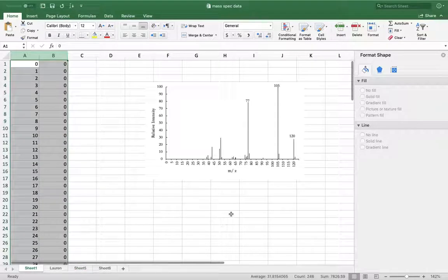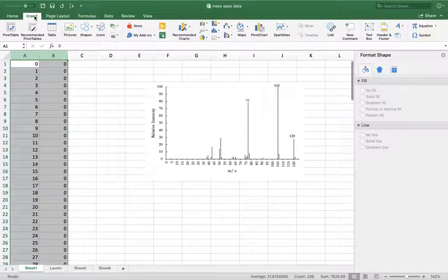So this is the mass spec that I've done for my actual class. You can also add a text box of the major fragmentation. So like this is my M plus. So yeah, that's beyond the point. But if you would like, you can always add them, and that's through insert, and you can create a text box, and you'll write the numbers of the major fragments.